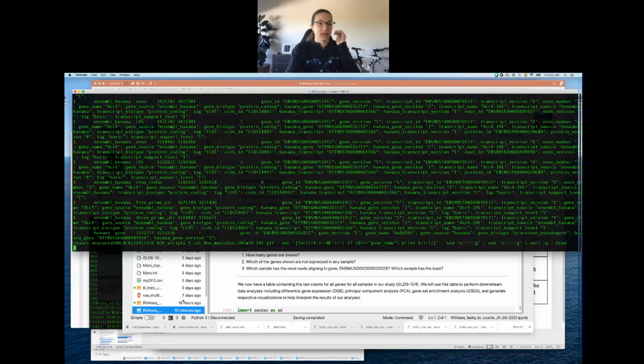So if indeed what I had remembered and what I told you guys yesterday is true, if we are having some gene IDs that are mapping to more than one gene name, then we should see fewer unique gene names.